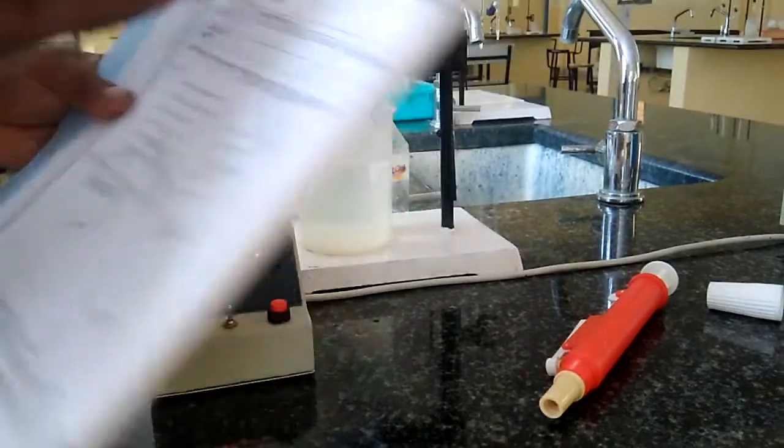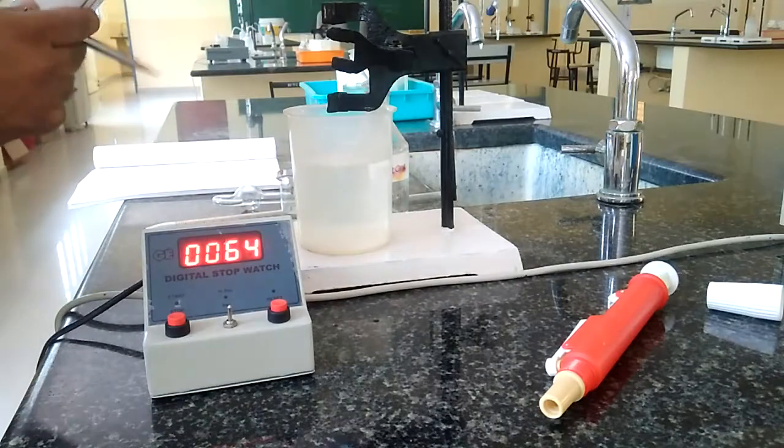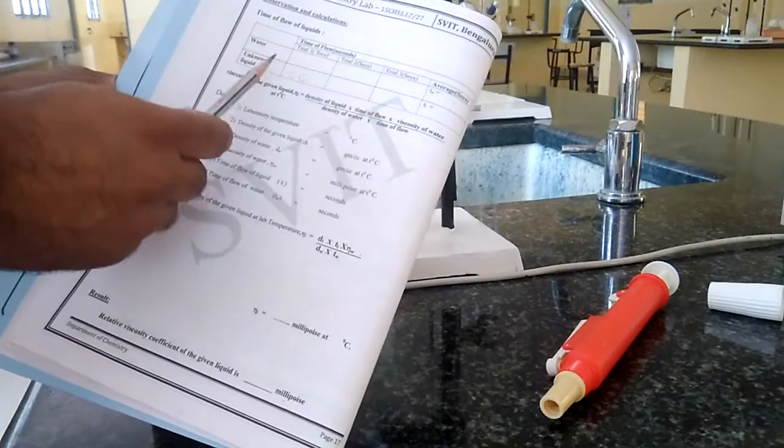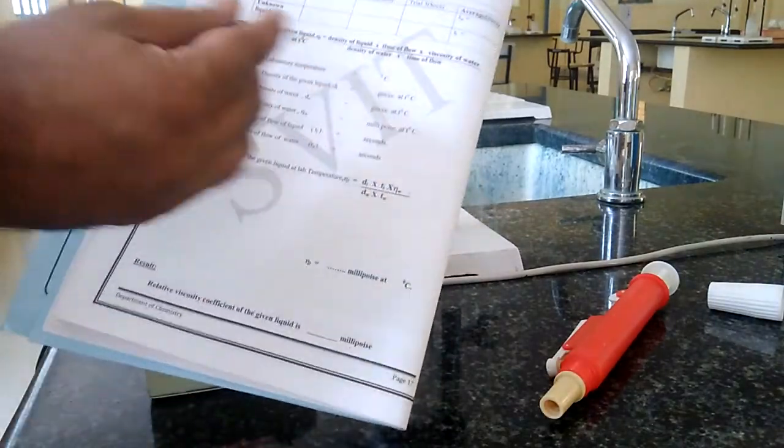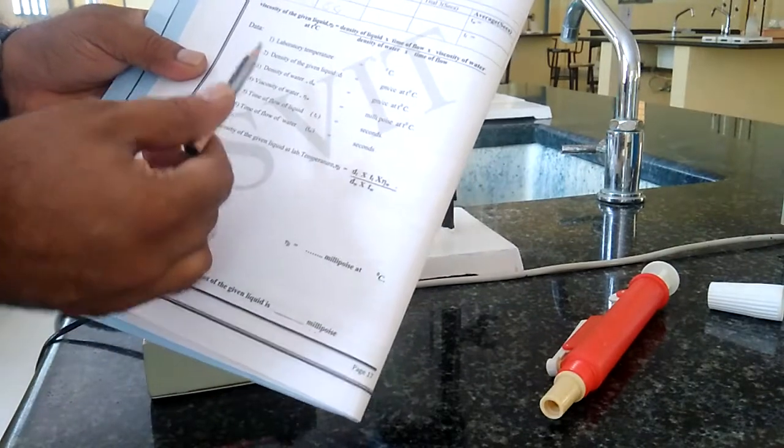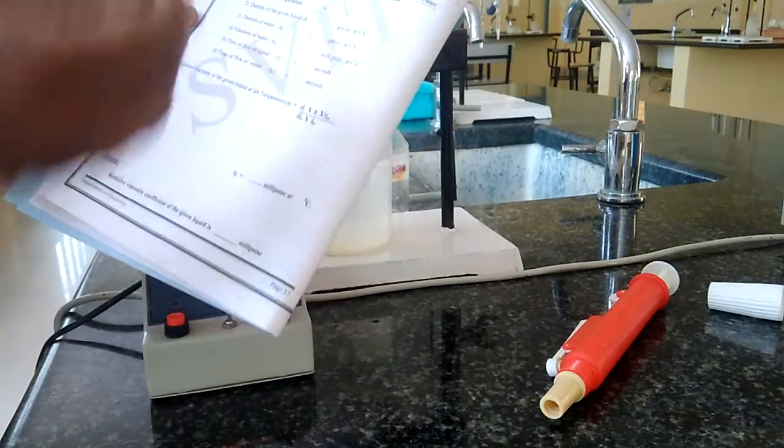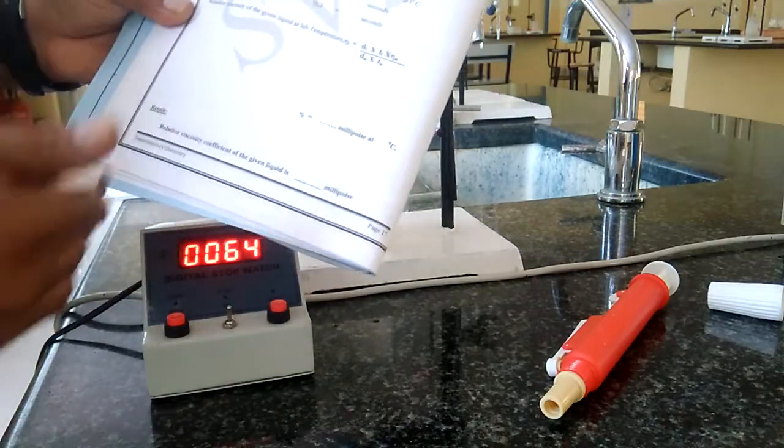After getting the viscosity readings for the water and the liquid, we have to do the calculation. We have Poiseuille's equation; with the help of that Poiseuille's equation, we are going to do this experiment.